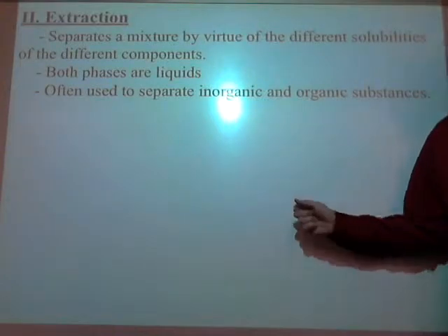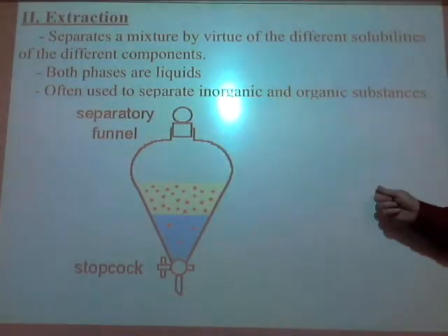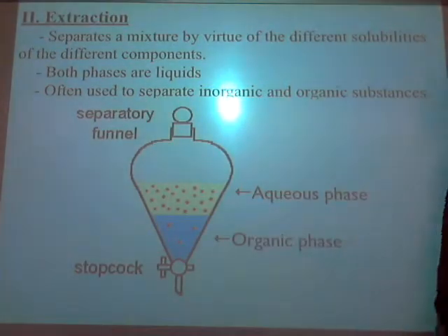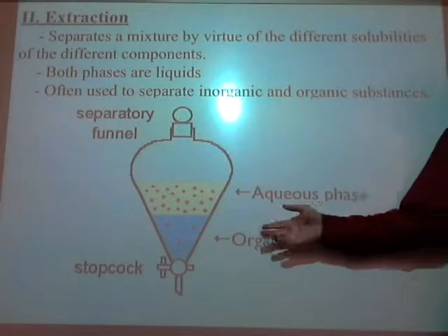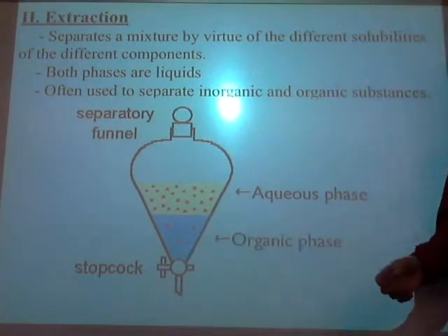Okay, that's why you don't spill it. Look here. We got two different phases. They're both labeled on your thing, I think. And this is how it's going to look for you guys. The chloroform is actually heavier. It sinks to the bottom, which is kind of unusual.